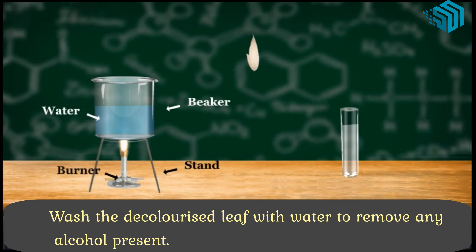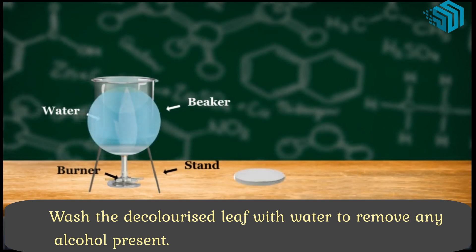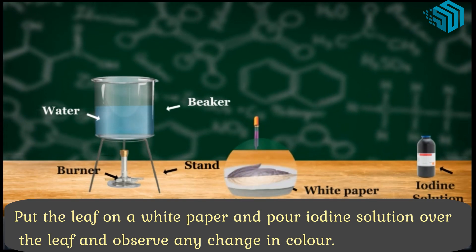Wash the decolorized leaf with water to remove any alcohol present. Put the leaf on a white paper and pour iodine solution over the leaf and observe any change in color.